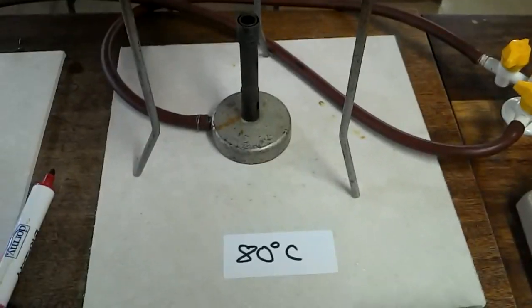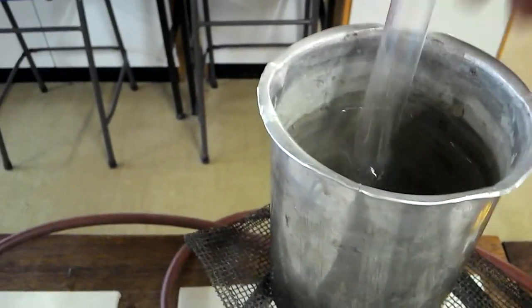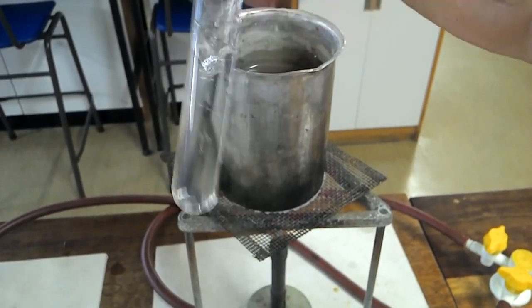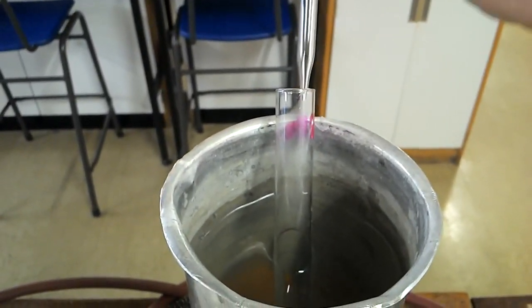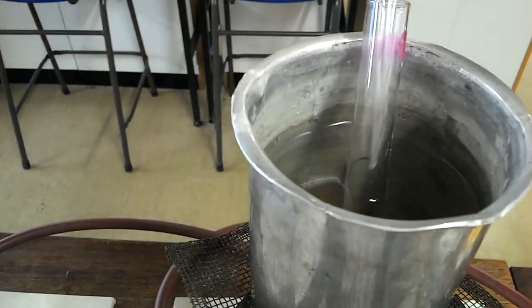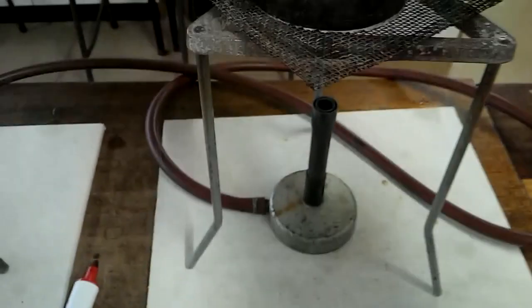And now 80 degrees. So we'll mix our enzyme and substrate. In they go. Flick mix, nice quick flick mix, nicely done. Into the water. Get ready with our new clean pasta pipette. Take our first sample, which we should have started the clock. Start the clock. Right, here we go. Take our first sample for time 0 to check. Here we go. There we are. Lovely. So it's pretty much working.